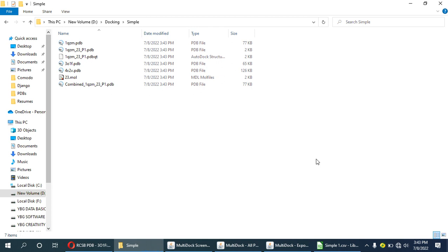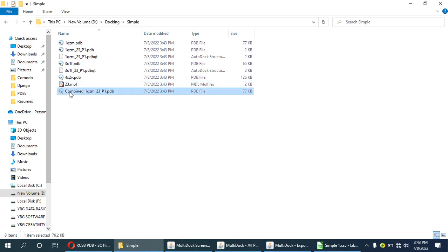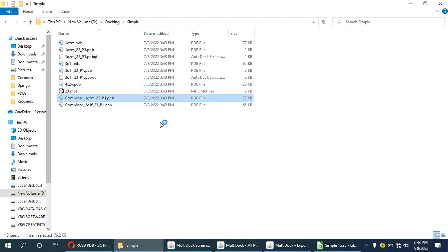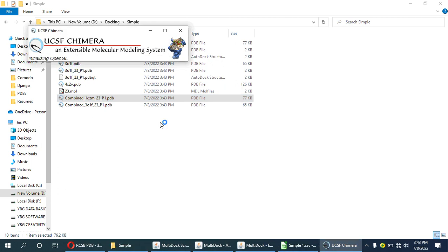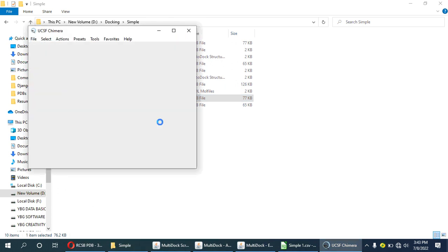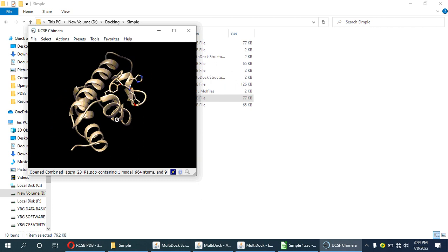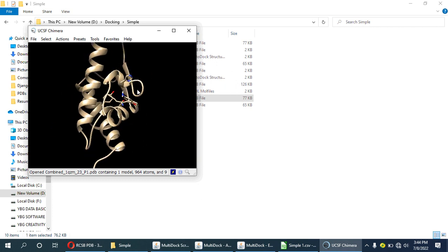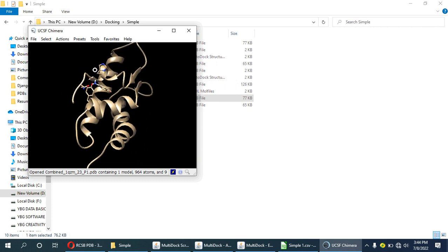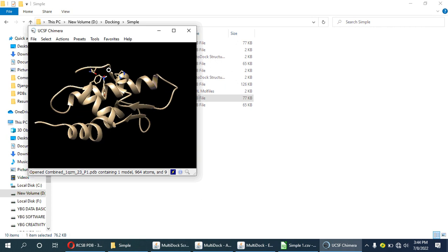For example, this is a combined file of 1QZN and the 23rd numbered ligand. This combined file is necessary for further analysis like molecular dynamics and ligand interactions.